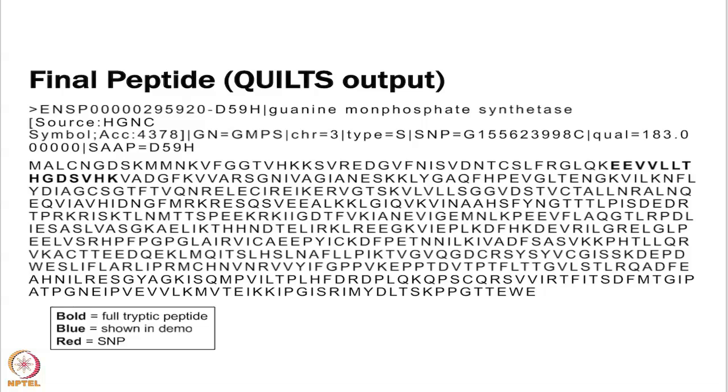Here is what the QUILTS, you could put this into QUILTS as a VCF file, you do not have to actually do this by hand. If you were to put this one line of the VCF file into QUILTS, it would give you a new protein sequence that would include that change in the amino acid based on the SNP that was given in the VCF file. That is just what I wanted everyone to be able to get a feel for using the IGV itself. The next one is going to be a little more difficult.